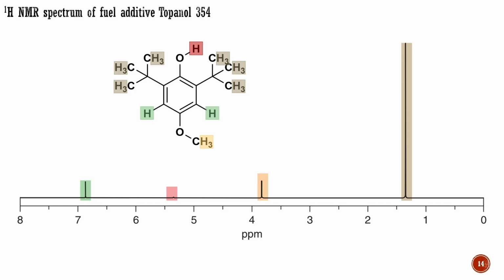Proton NMR exhibits many more features, which we will set aside for the moment. It is no exaggeration to say that, in general, proton NMR is more critical for the routine determination of structure than all the other methods combined. We will revisit proton NMR in more detail in a separate module.